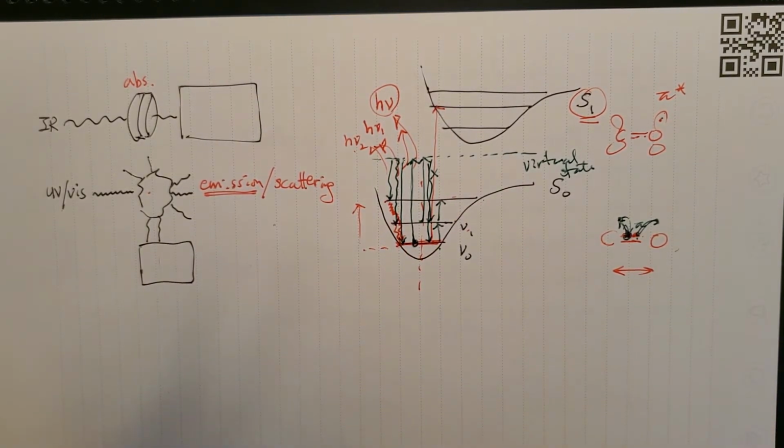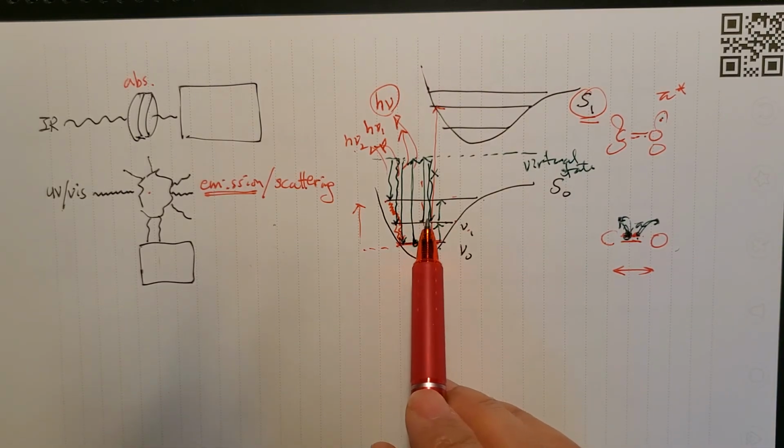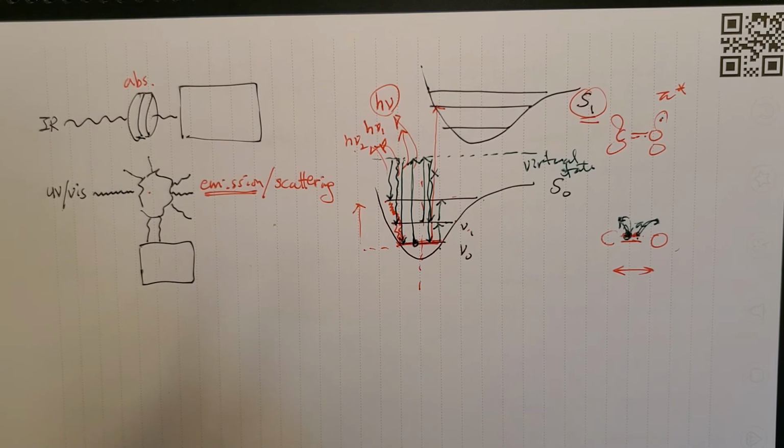So there will be heat emission. When you keep shooting UV at the sample, you have to know the sample in the machine gets warmer and warmer. Therefore, if you run the Raman experiment too long, you end up populating more sample over here, and your data is not going to be the same as the initial one.